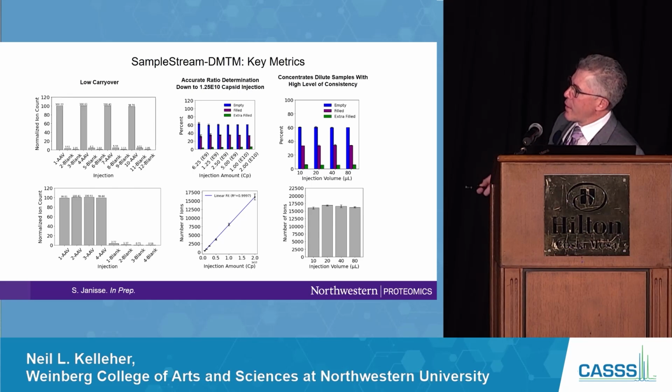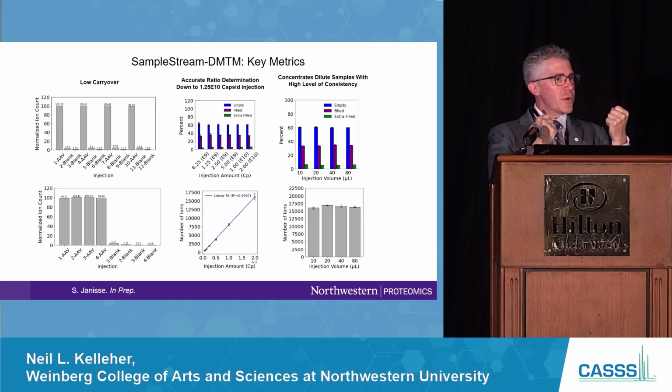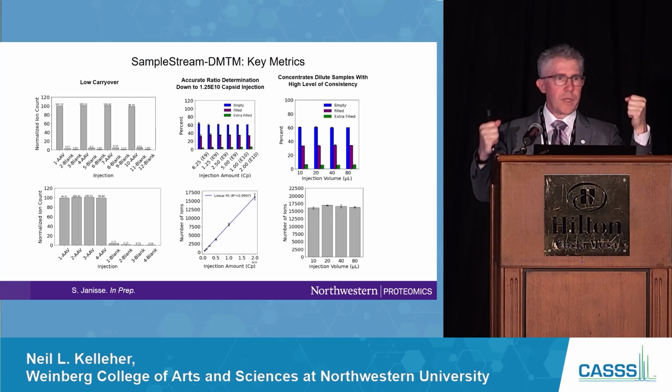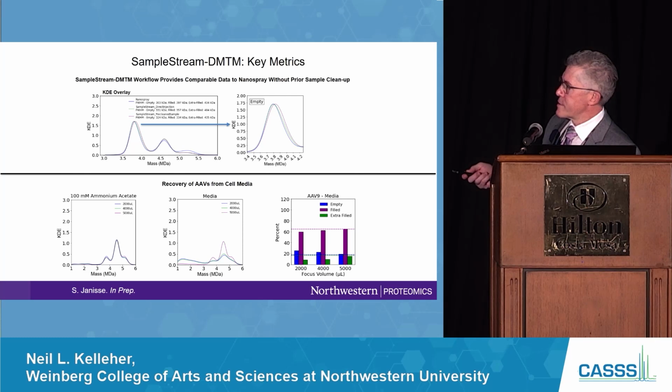Here's when we have empty versus full, the reproducibility of it is quite good, and we contrive these mixtures. We create different ratios, 50-50, 70-30, 30-70, et cetera. And I think that's shown on the next slide. Oops, no, I took it out.